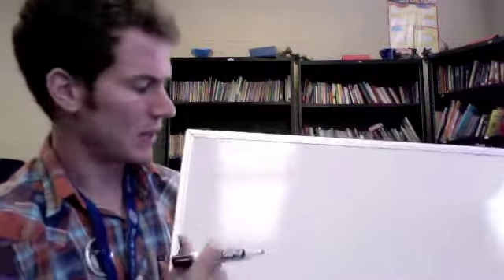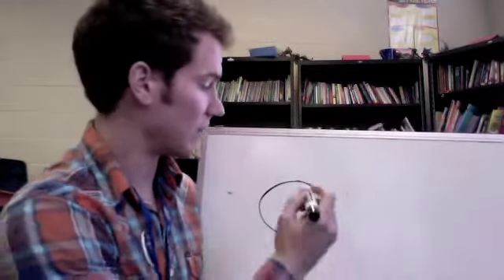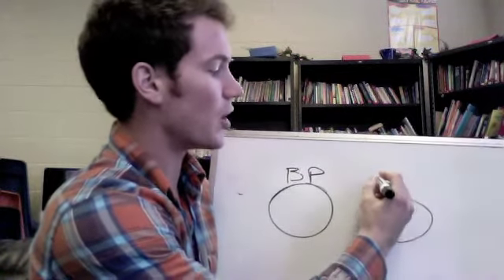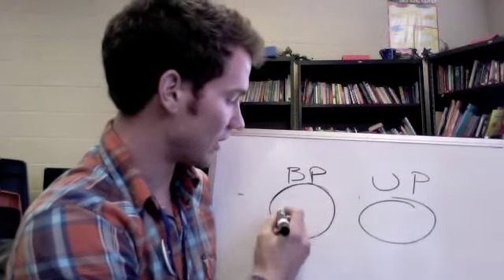So I'm just going to quickly draw out how we would go about plating a dependency test. As shown in that image, we have one plate that would contain both our prey and our bait, so our HspB2 and our identified protein. We'll put that right here. And then we'd have our other plate. We'll put bait and prey. And we'll have our other plate that has our unrelated protein and our prey.